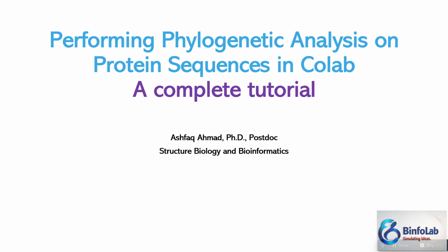In our last video, I performed a tutorial on how we analyze nucleotide data in Google Colab for phylogenetic analysis. Today, I'm going to teach you how you can perform phylogenetic analysis on protein sequences in Colab. It's a complete tutorial just like before. So let's start.